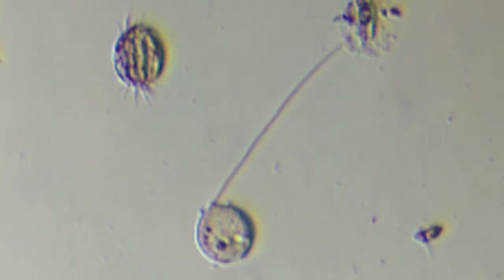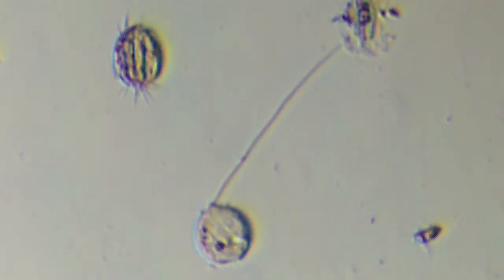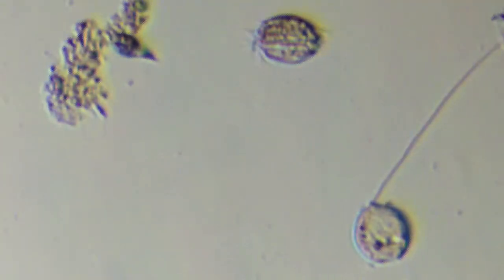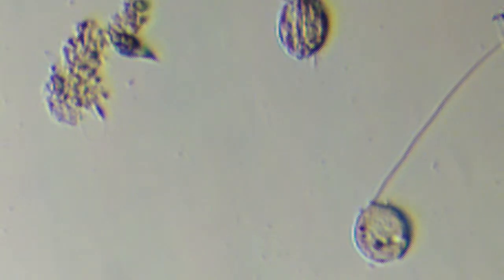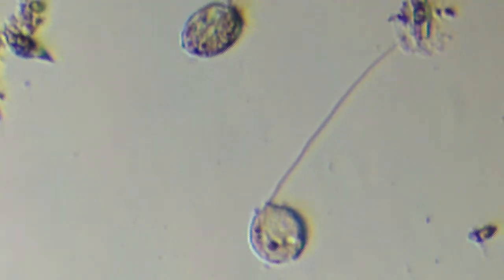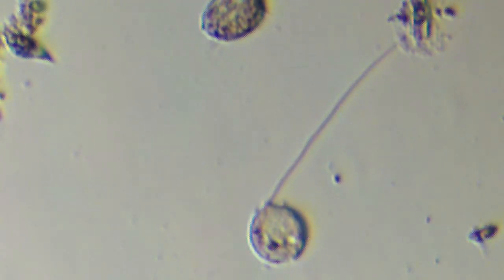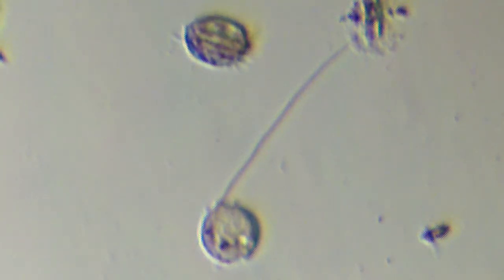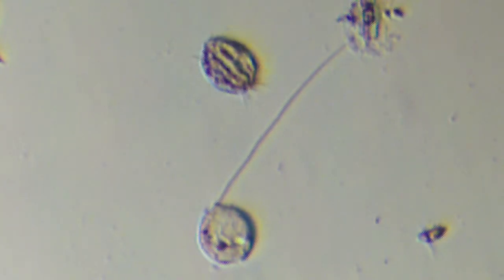So they usually have the cirri at the poles, so basically the top and bottom of the cell. And the rest of the cell is just normal cilia. This one has some nice striations on it too, and some structures inside. So it's small enough to be Euplotes. They usually have more of a concave side when they rotate. I haven't seen it rotate yet. Stylonychia is usually longer, tapered looking.